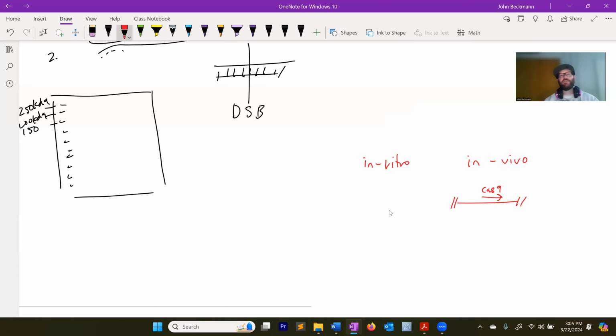In what case are you using recombinant Cas9 in vivo? This would not be recombinant protein expression that you purified from E. coli. This would be transgenic insertion. What's the usage case where you're making recombinant Cas9 from E. coli, purifying it, and then using it in vivo? What does that actual usage case look like?